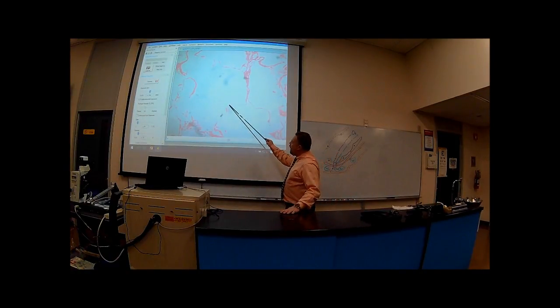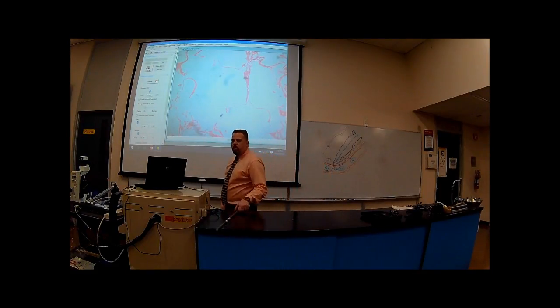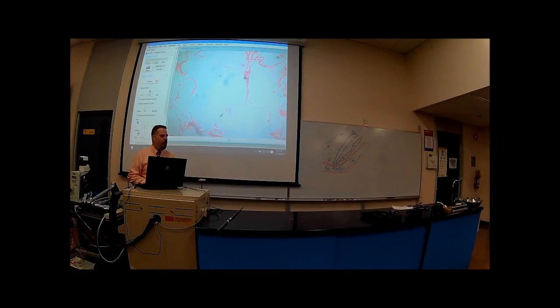So this is emphysema, where it's overly stretched. Even this, look how thin this simple squamous epithelium is. It's really stretched. Those are really thin over here, which is what you expect. And what's the cause of emphysema in 99% of cases? Yeah, smoking, okay? It just destroys the elasticity of this lung tissue, okay? So that's emphysema, pretty easy. I don't even have to get that close up. You get the picture of what that is, okay? All right, let's look at our next one.